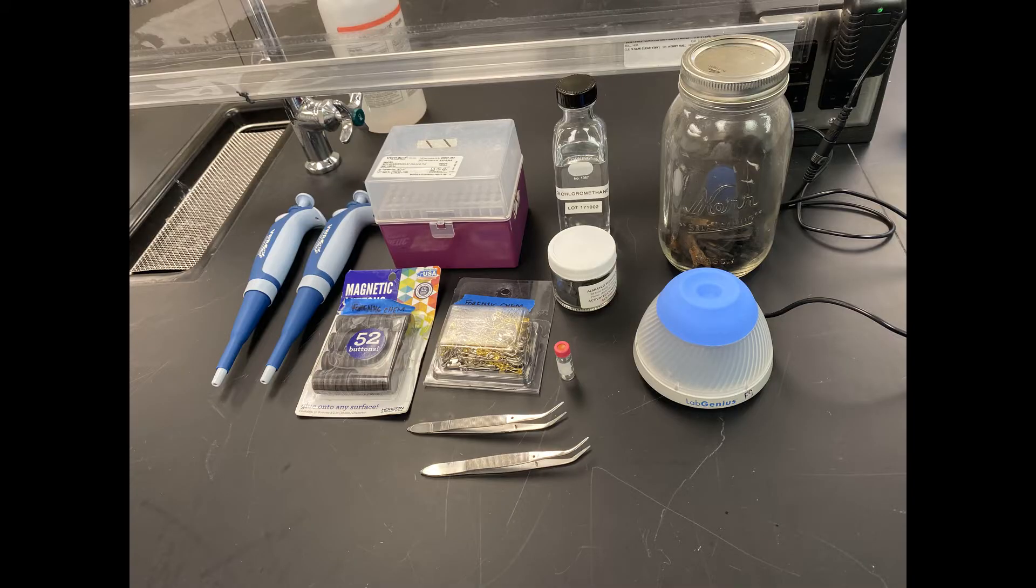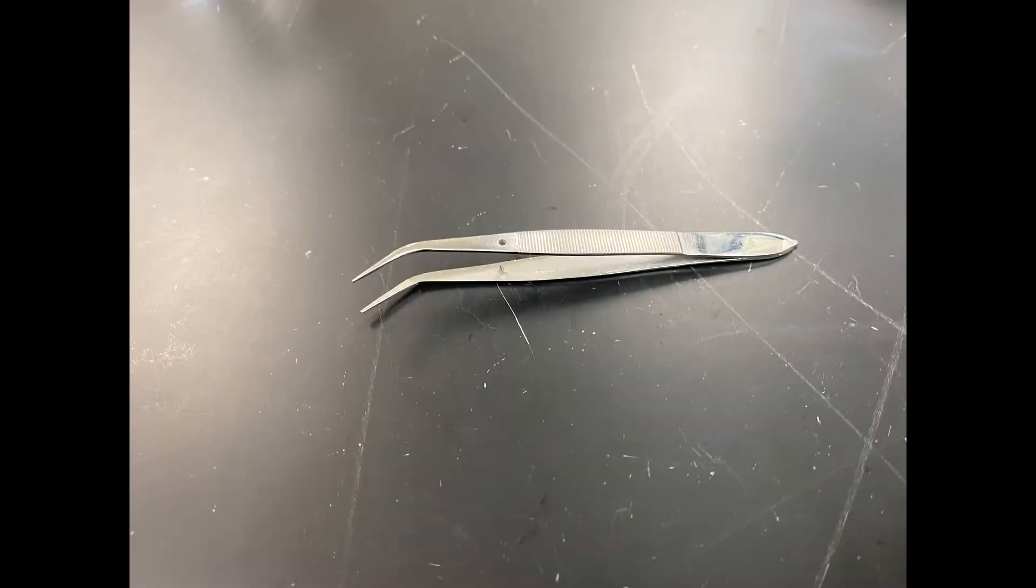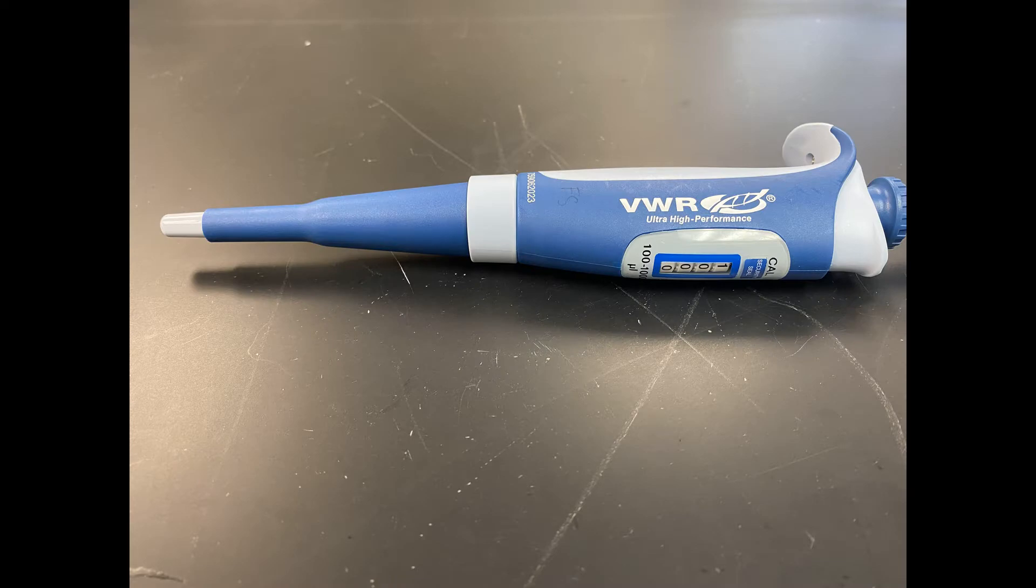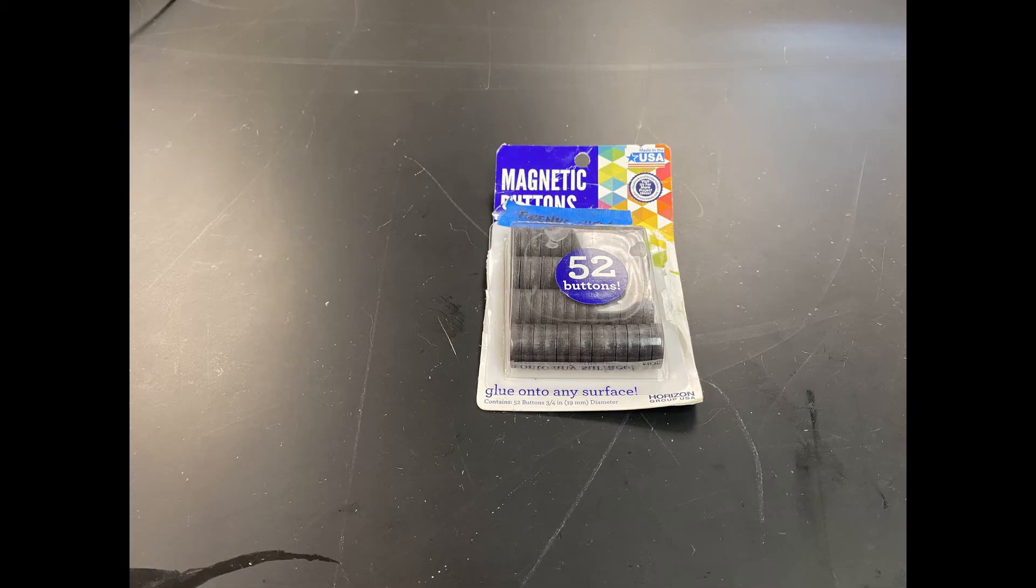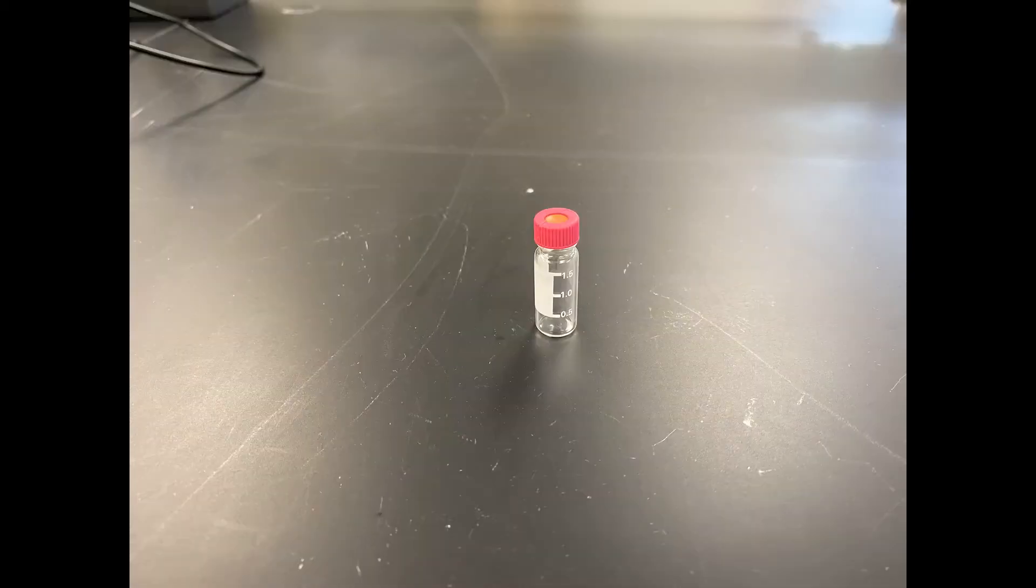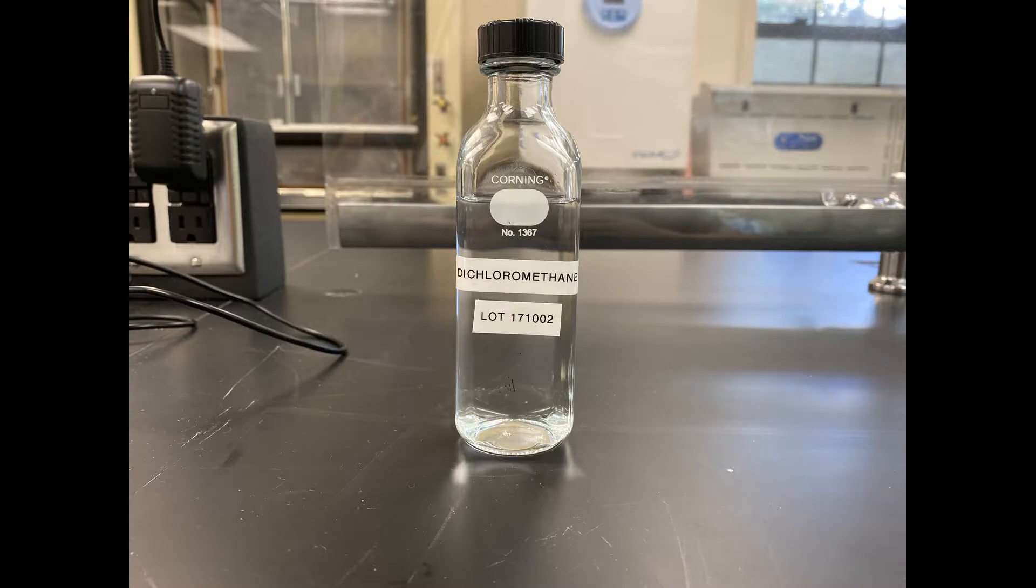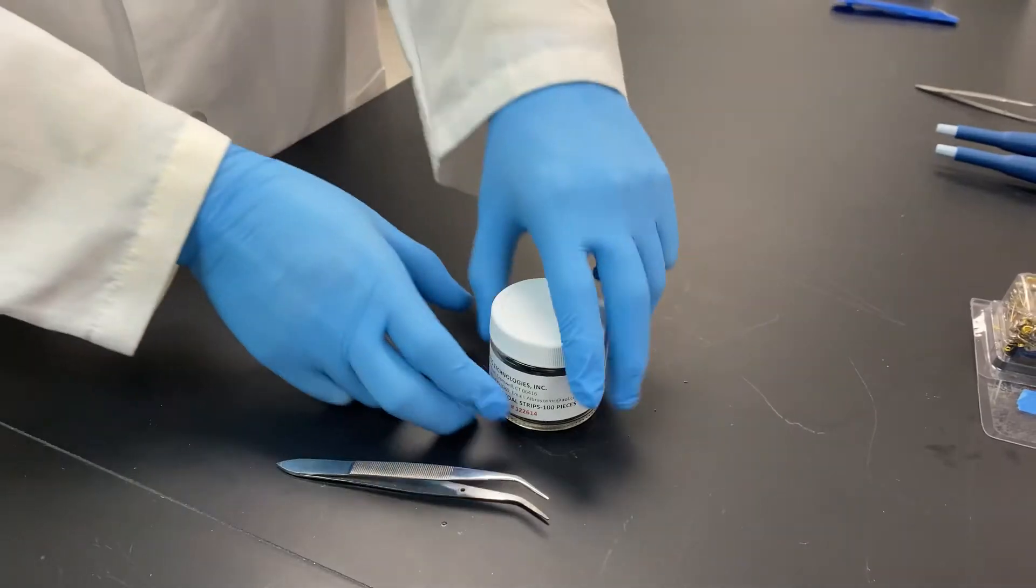In order to perform your fire debris analysis, you will need your fire debris, activated charcoal strips, tweezers, a micropipette, pipette tips, a button magnet, a safety pin, a 2 milliliter GC vial, a vortex mixer, and dichloromethane.